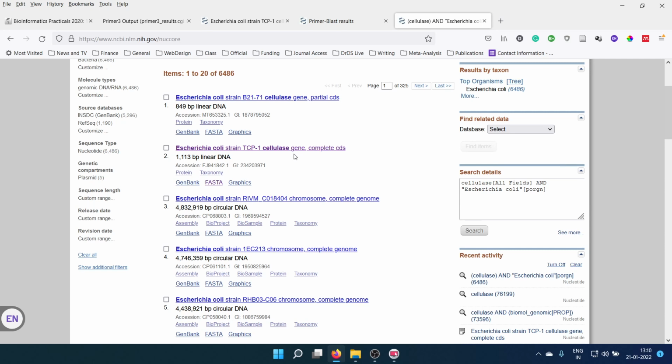To completely copy that sequence, you need a primer which will lie before the 1000 bp sequence and another that ends after it. So, the entire region of the DNA or FASTA sequence that you copy should be longer than the sequence that you want to amplify. Which will be generally available only in the complete genome, not in the partial sequences shown here.